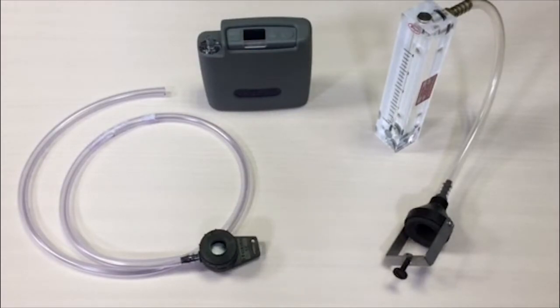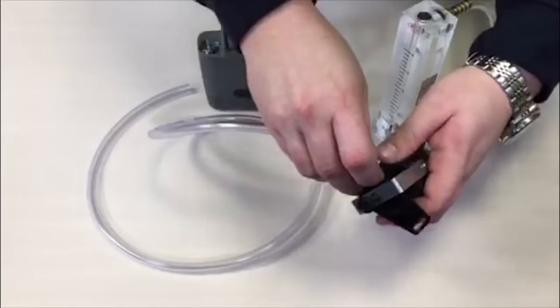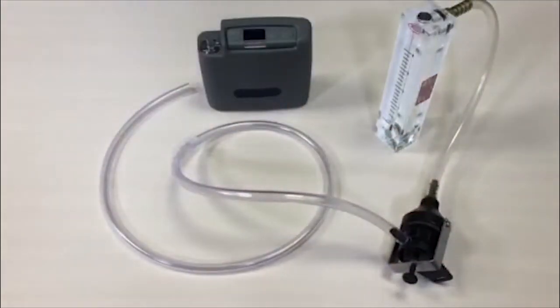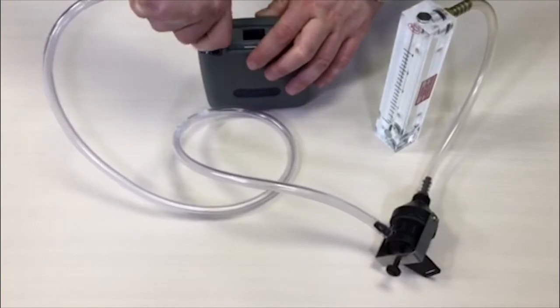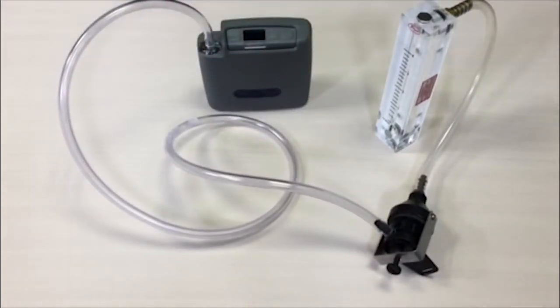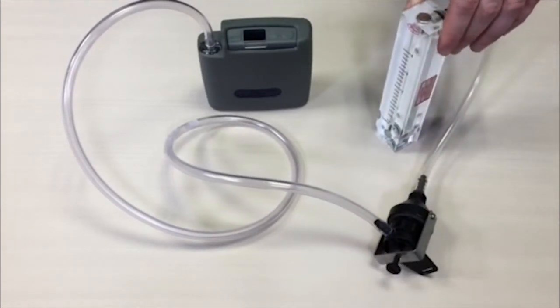To assemble the sample train ready for flow calibration, attach the sampling head to the flow meter, then attach the sampling head to the pump. Note that the flow meter goes before the sampling head, not in between the sampling head and the pump. Ensure the connections are secure and tight to prevent leaks.